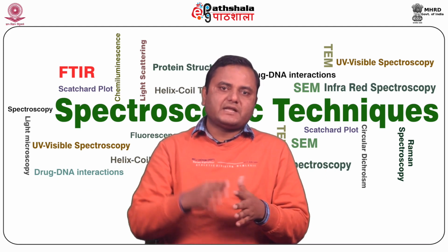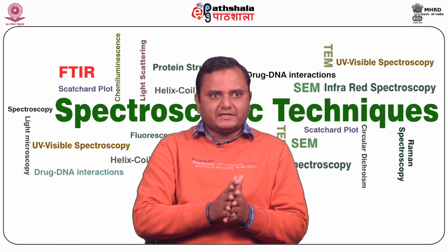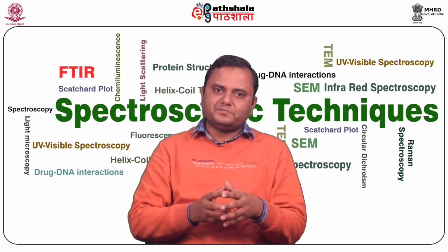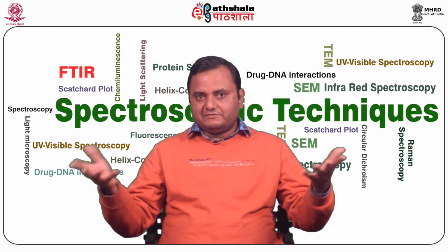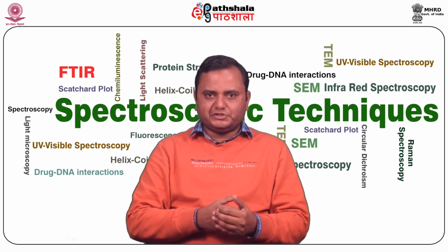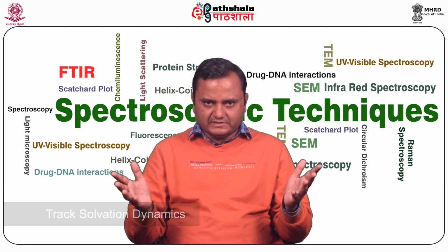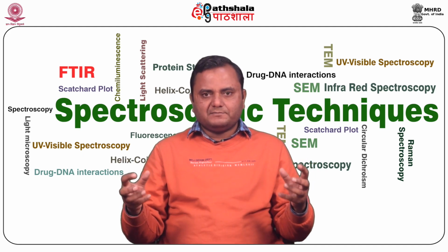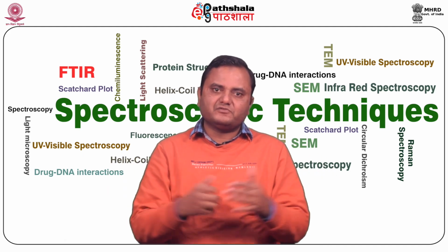Then this technique is also used to track any biochemical reaction, as the reaction proceeds from reactant to product. The disappearance of reactant and appearance of product can both be simultaneously correlated by fluorescence spectroscopy. In this way you can measure the progress of a biochemical reaction, and you can even entrap intermediate states. It is also used to estimate the local friction of macromolecules, and to track the solvation dynamics of compounds. Most importantly, it is used to measure the distance between two molecules, or the change in distance between them, by a special type of fluorescence known as fluorescence resonance energy transfer, FRET.